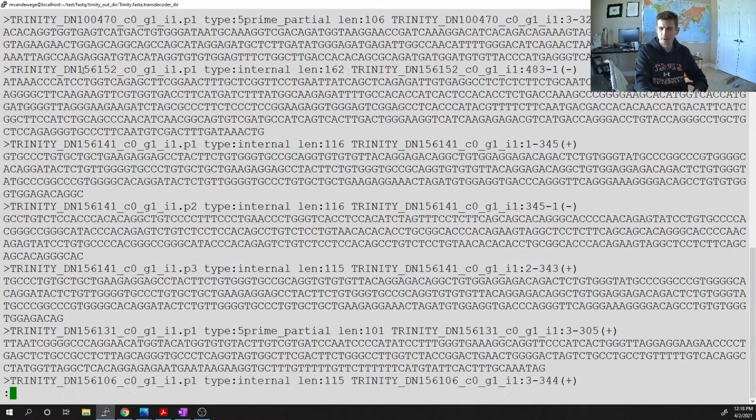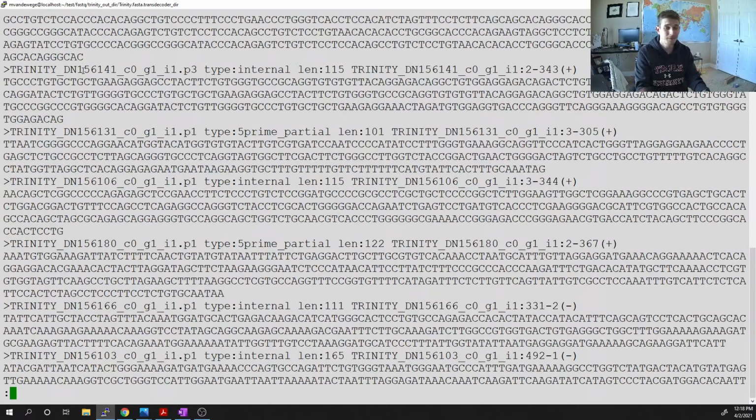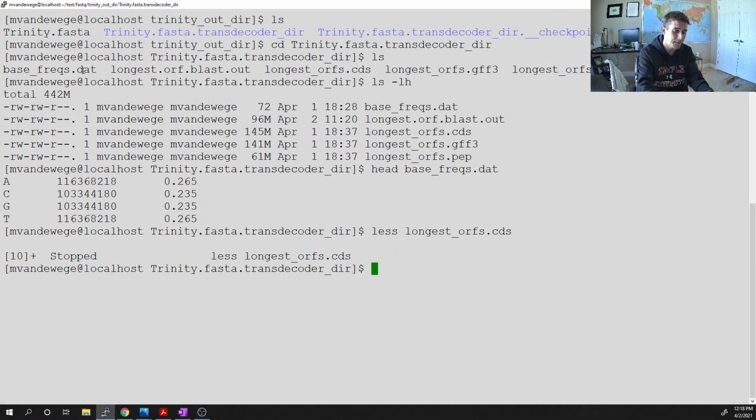And a lot of these are internal. A lot are internal. A lot are partials. So let's first off see how many passed, like how many transcripts actually had an open reading frame.